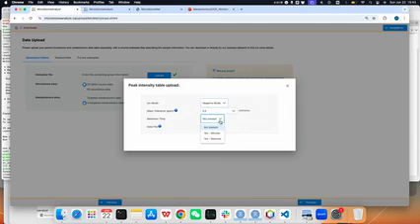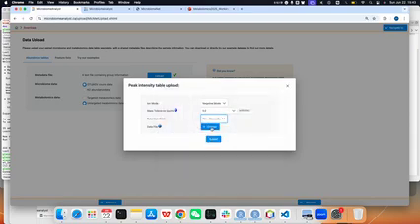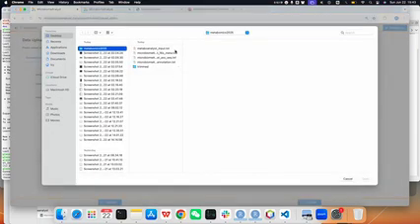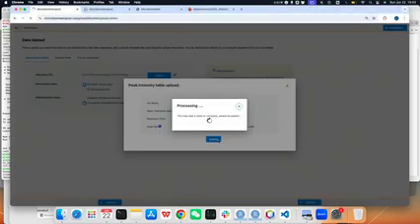Then we have the retention time, and we can upload the peak intensity table, and you can see the intensity looks like this. It just changes the feature names to the peak names. The other part is all the same as the ASV table. So we just choose and submit.